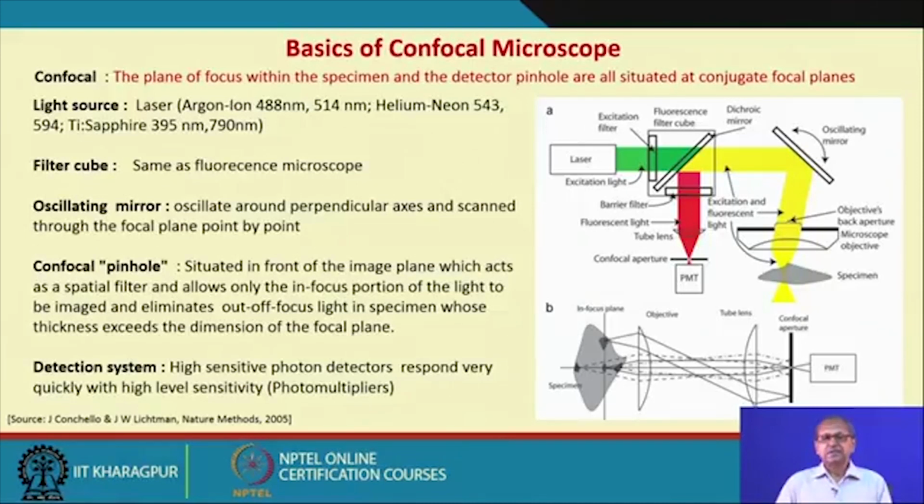So, what are the essential parts in scanning laser confocal microscopy? What do you mean by the confocal? Confocal means the plane of focus within the specimen and the detector pinhole are all situated at conjugate focal planes.